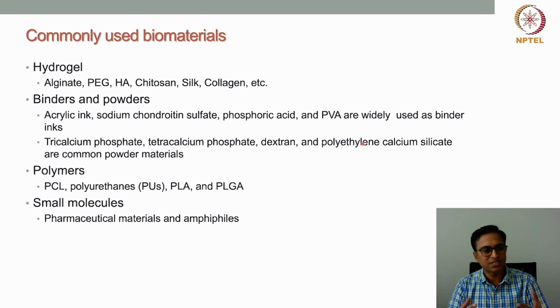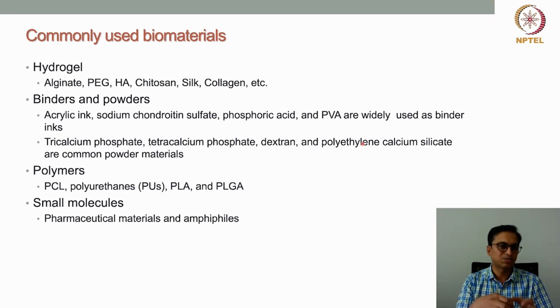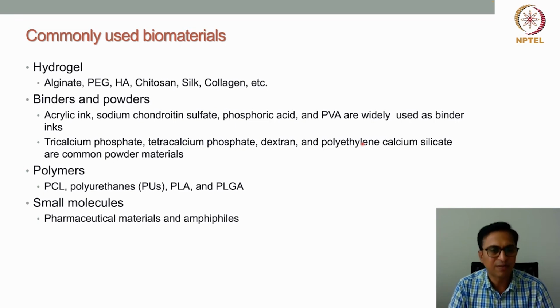After that, we solidify or stabilize them by heating. Upon heating, what will happen? These powders will get fused with each other, and the unbound powder after inkjet printing, we can easily remove, because those are loosely attached. And the bound structure, the structure that is built by these binders, can be heated up, and then we can get the final product.